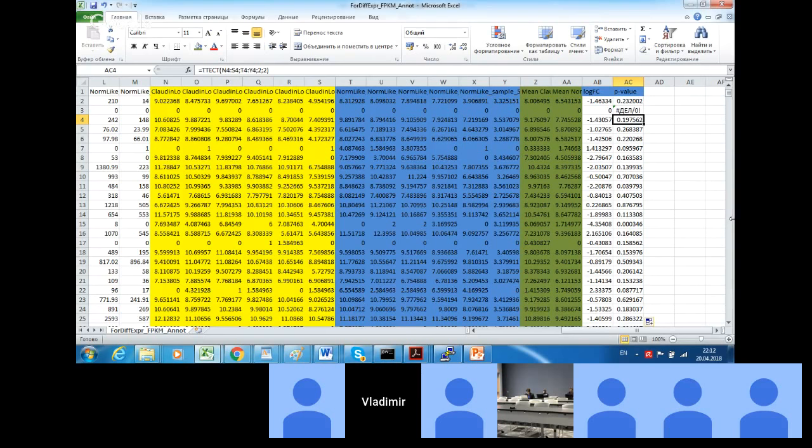These values are really similar. This difference is insignificant in this case, but we just see that application of different statistical methods gives us different p-values. And that is why it's really important to specify the type of the differential expression analysis that is used, as really different approaches can provide us different results with slightly different sets of differentially expressed genes.